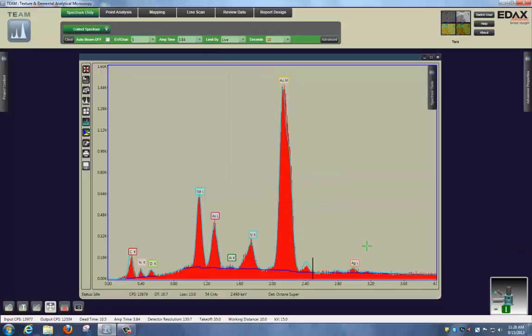Likewise, you could automatically add peaks by just simply clicking on an area in the spectrum where you might want to add them. You'll have a cursor that comes up with a question mark. Generally, the most likely solution is at the top of the list, and by hovering over your choices, you can see which ones might fit.